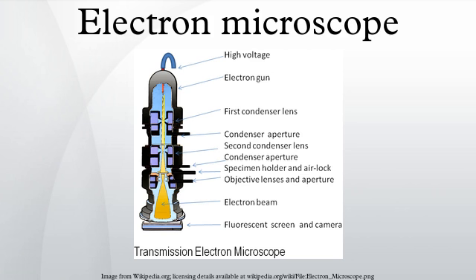The major disadvantage of the transmission electron microscope is the need for extremely thin sections of the specimens, typically about 100 nanometers. Biological specimens are typically required to be chemically fixed, dehydrated and embedded in a polymer resin to stabilize them sufficiently to allow ultra-thin sectioning. Sections of biological specimens, organic polymers and similar materials may require special treatment with heavy atom labels in order to achieve the required image contrast.